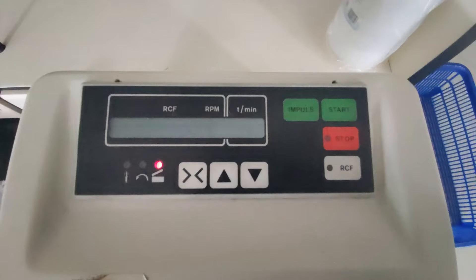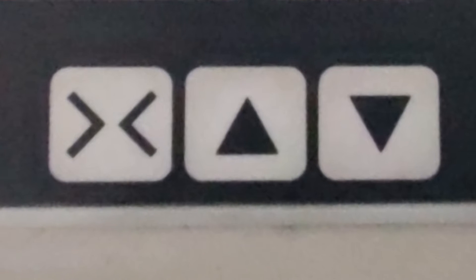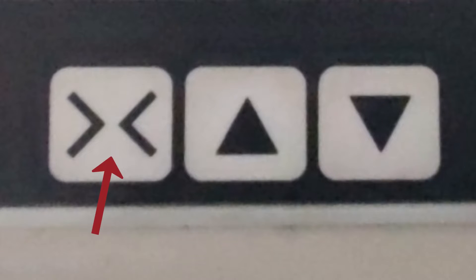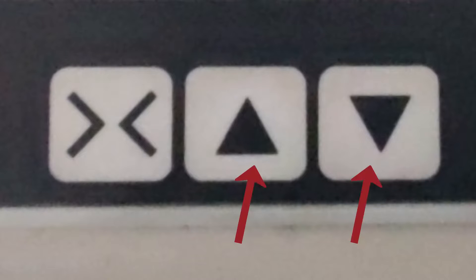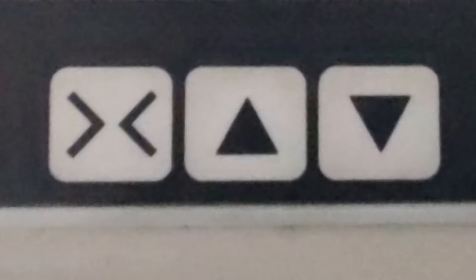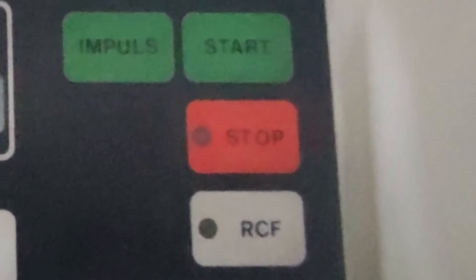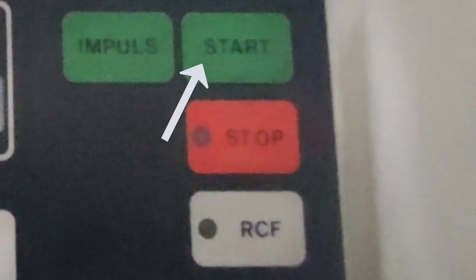I will explain the control and display elements. The first thing we have is the entry field — this selector T for selecting individual parameters for numerical input. It will display a symbol on the display. You can change the value by pressing the up and down buttons to increase and decrease the value.